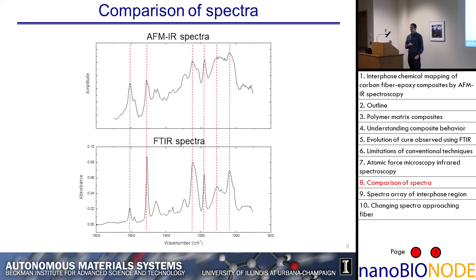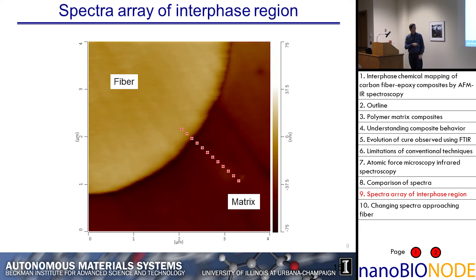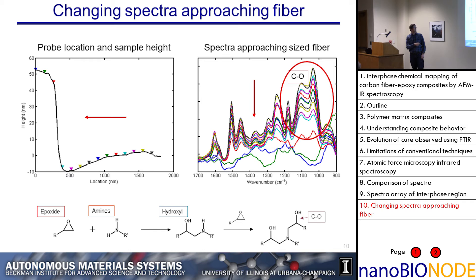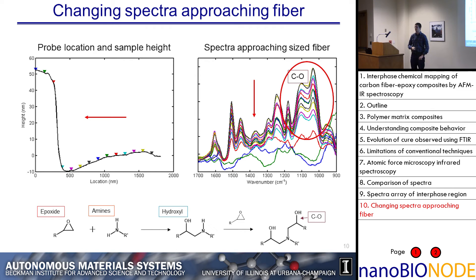The next step is to look at how the spectra changes in the region close to the fiber. I've taken a 4x4 micron AFM scan of the sample and we're interested in what the spectra does in this region. As we approach the fiber surface, we see a decrease in the overall signal. A related study showed this is due to the change in height near the surface — it's quite difficult to get a perfectly flat composite sample because the components polish at different rates. So there is a decrease in the overall signal, however we can normalize this signal and expect the ratio of different peaks to remain the same for a given spectra.